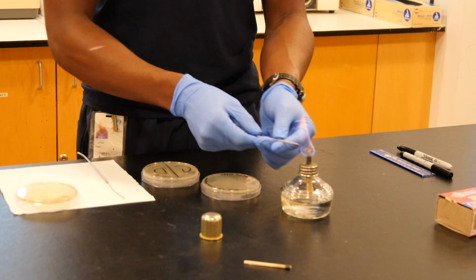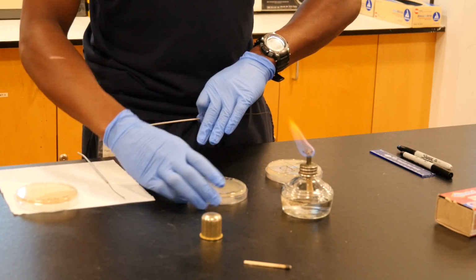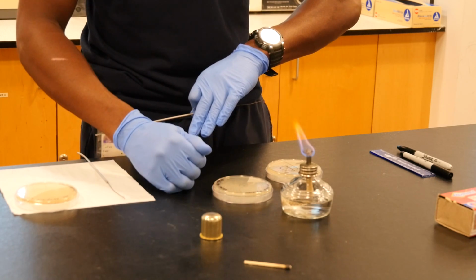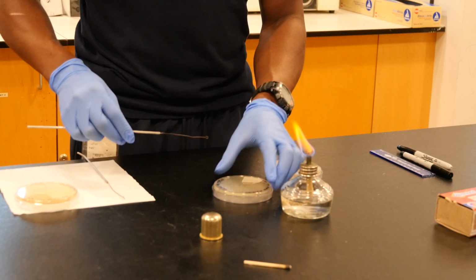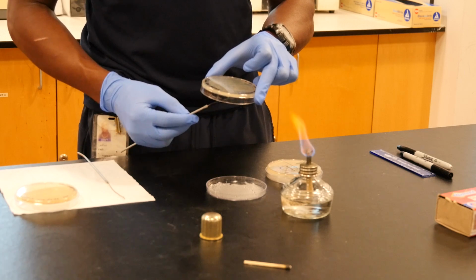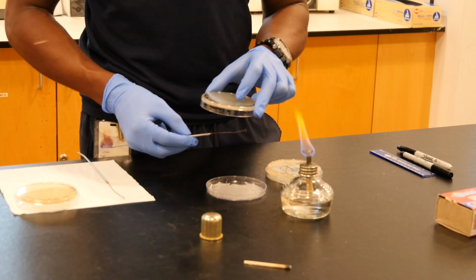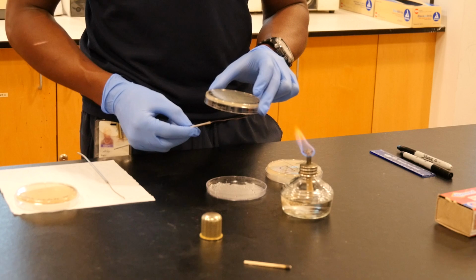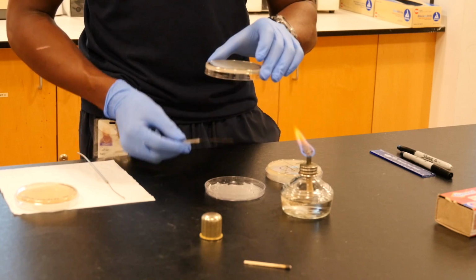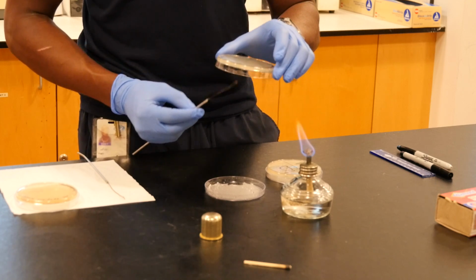I'm going to burn my loop again. As I'm burning my loop, I'm going to let it cool off like this, right? And I'm looking at my culture plate, E. coli, and I'm going to tell myself which side I want to streak from, and I see a good side to streak from. Before that, you want to make sure you touch the loop to the end of the agar so you don't hear a sizzling sound, which means it's not hot. But if you do hear a sizzling sound, it means it is hot. If you don't, you're okay to streak, right? As you guys can see, I picked up my culture plate coming upward, so there's no bacteria that can get inside of it. I'm going to do one good streak, and I'm done, all right?